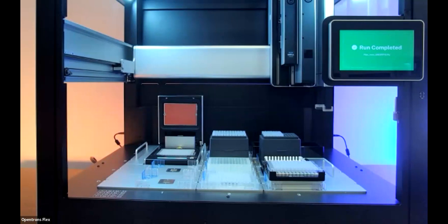Yeah, maybe just to add that we do recommend hard shell or Opentrons tough plates, which have a stronger frame. And we do recommend full skirted plates just because normal PCR plates tend to warp. That is also the risk with semi-skirted plates.